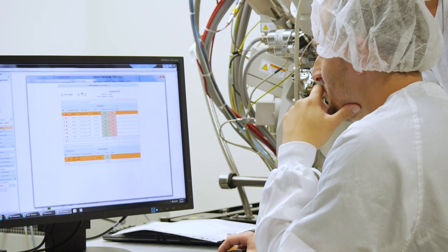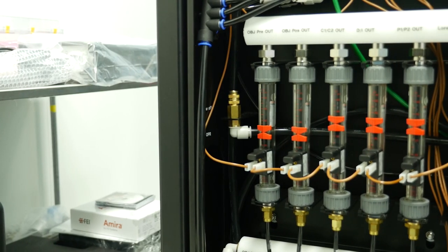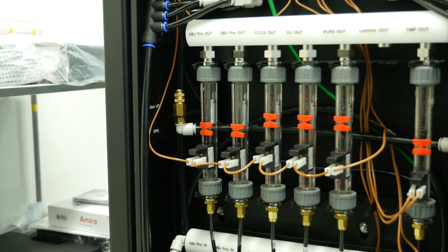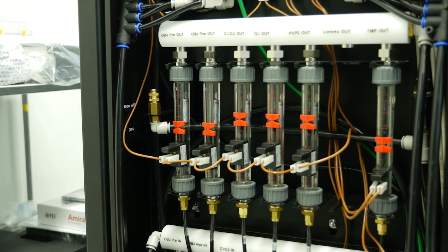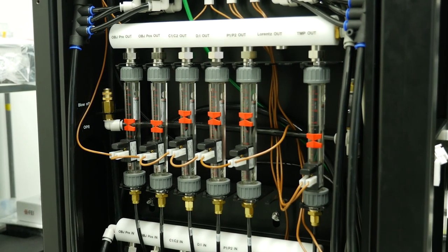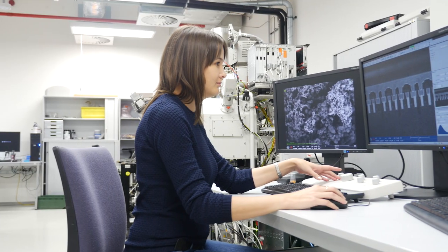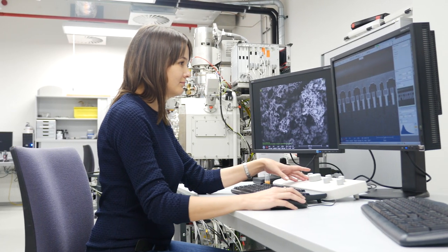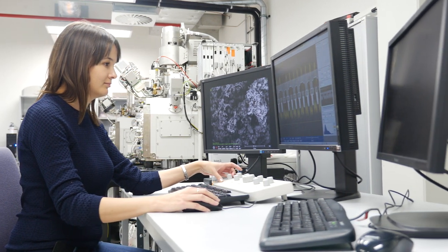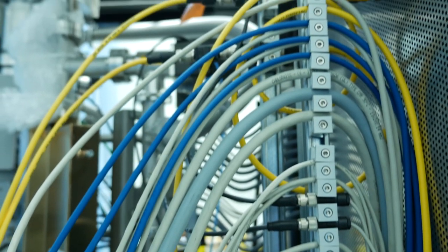The microscope must be continuously cooled down because the magnetic coils which focus the passing electron beam are warmed up by the strong electric current running through them. Let me guess, without cooling, they would be destroyed. That's why the temperature of the cooling water is maintained with regards to standards of local production with a maximum deviation of a tenth of a degree Celsius in half an hour. Without this stability, it would be impossible to achieve a stable image in high resolution.